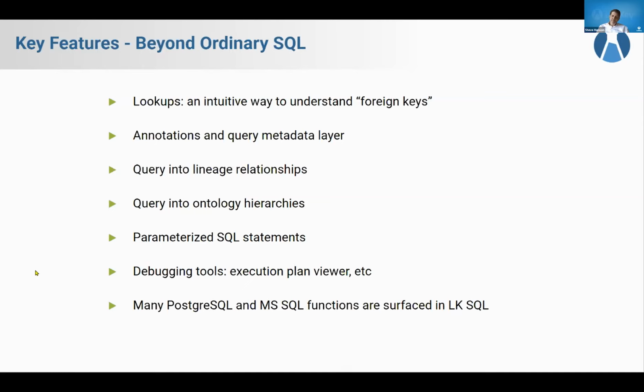And also, many of the functions that are native to Postgres and Microsoft SQL Server, we just pass through into LabKey SQL. So if your underlying database is Postgres, you're not shielded from the native functions that are in Postgres. We let you use them right inside of LabKey SQL.